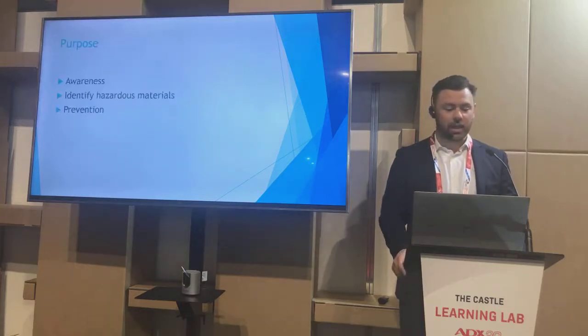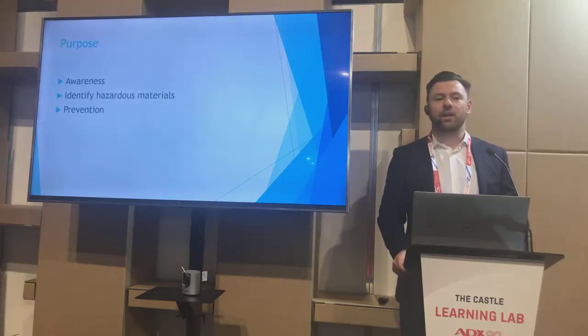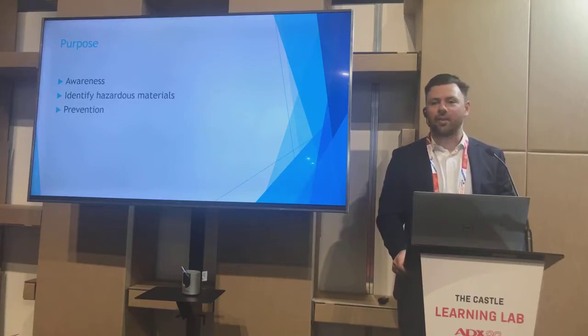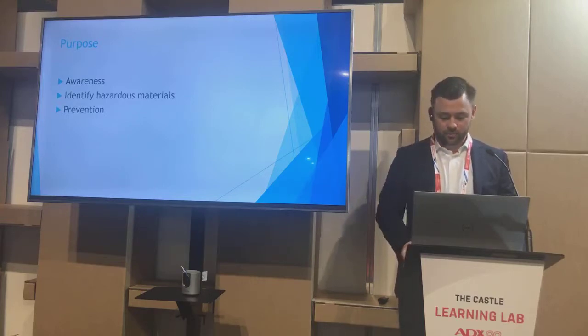And so today I just want to provide you with awareness on the different dust applications, the hazardous materials, and prevention in your lab and or clinic.